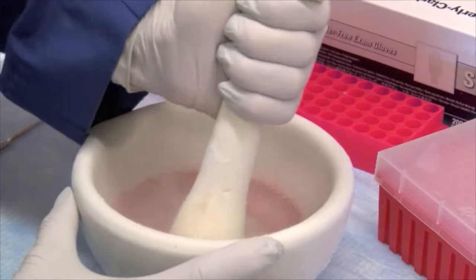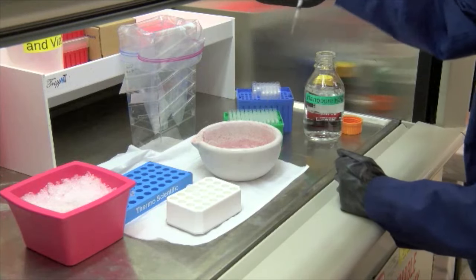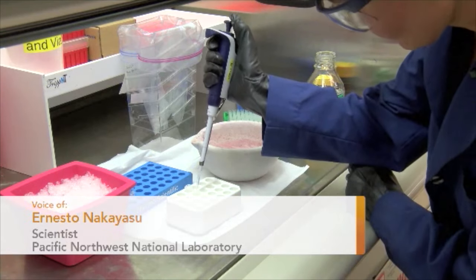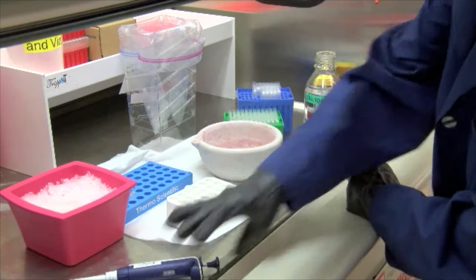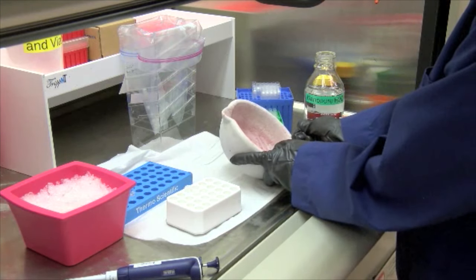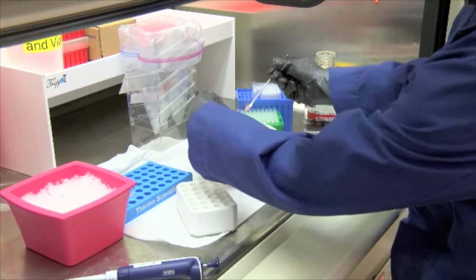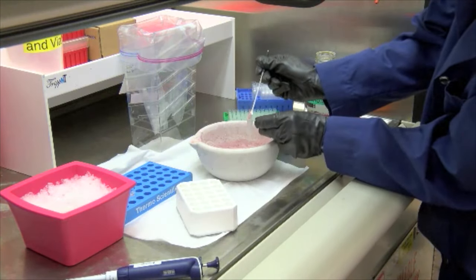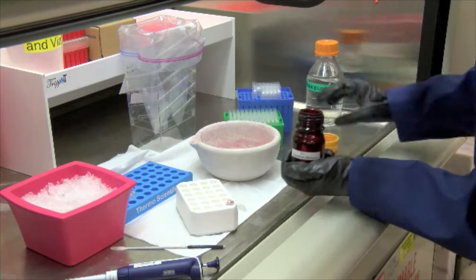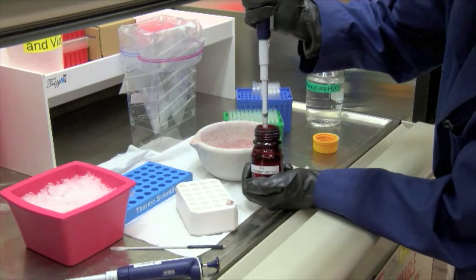So what you want to just ensure that it stays nice and frozen. Now we're going to add water. And then scoop some of the ground tissue. Then we add to the step chloroform methanol to help extract different types of molecules.